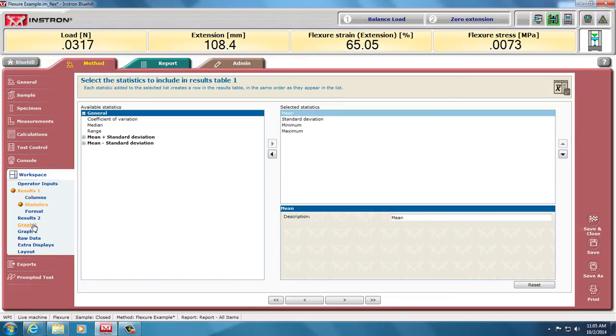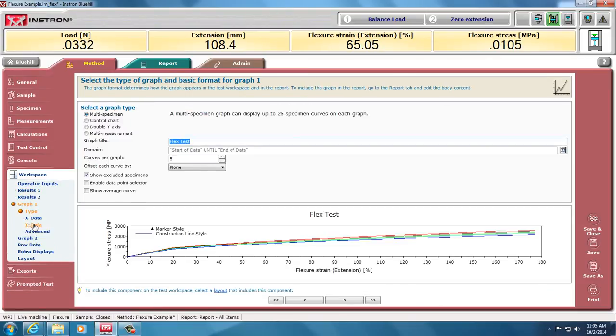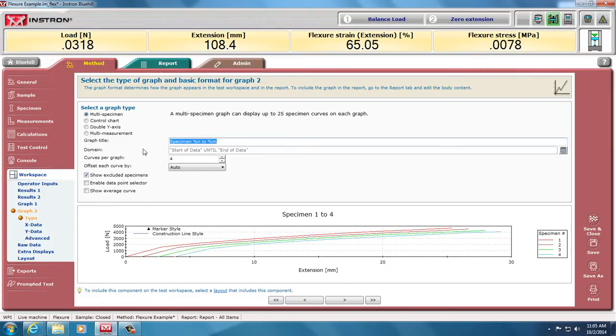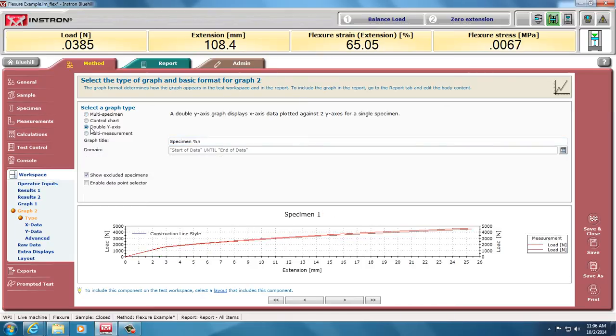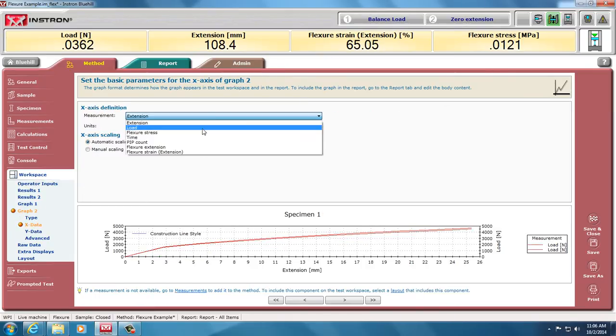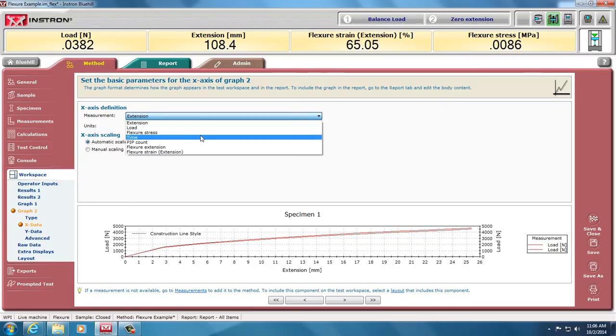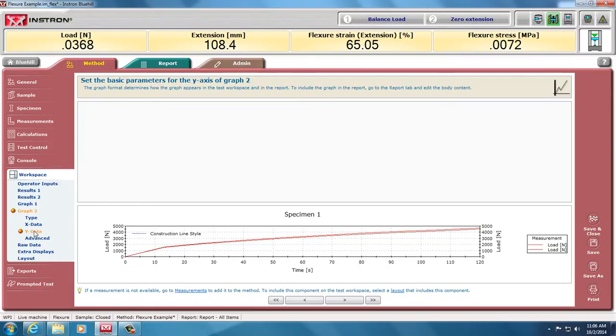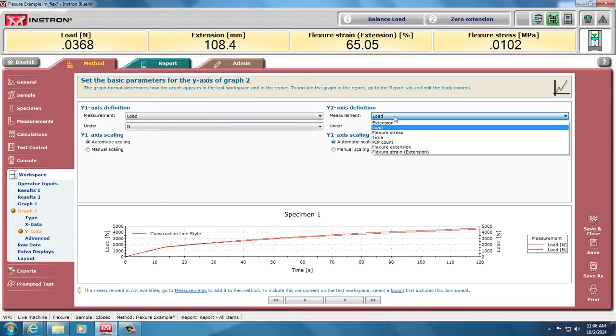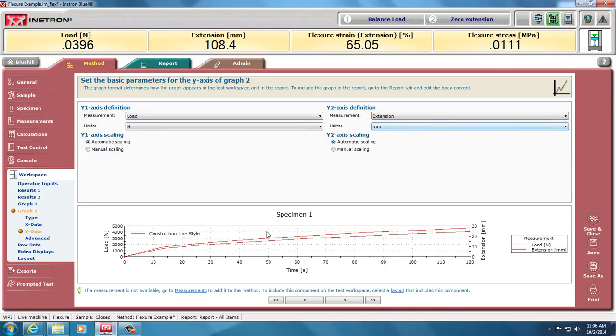We can take those out if we want, and we can graph as we do for other tests. Here we're plotting stress and strain already for the first graph. For the second graph, I'd like to see what's happening over time. Instead of multi-specimen, just during the test, I'd like to see the double Y test with time on the X-axis and both my load and displacement extension on the other axis.